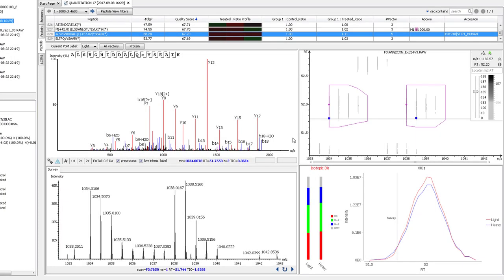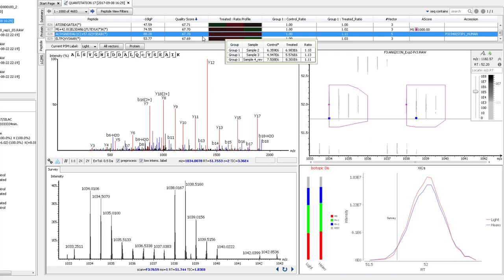Here in the peptide tab, you can see all of the important details of a peptide's quantification in one page. The top table gives a quality score, heat map, and ratio of the peptide.